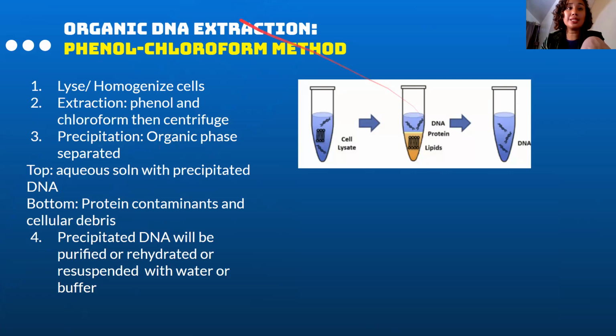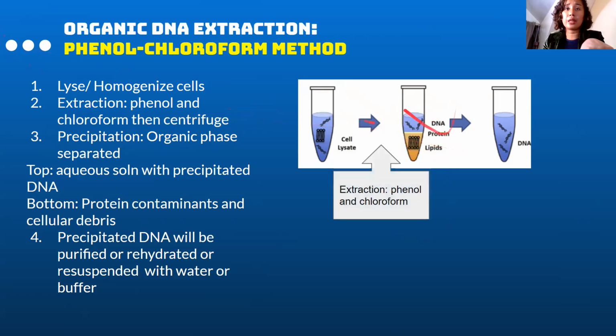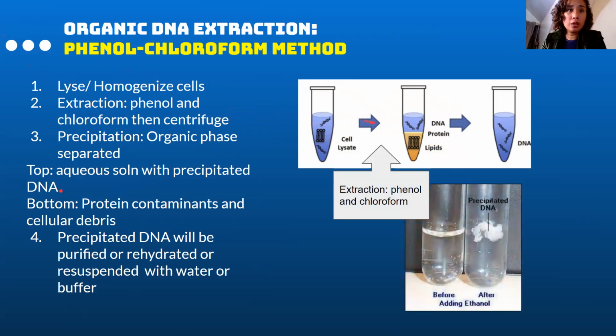So basic steps, lyse the cells, open them up, so that you free the nucleus, your DNA. And we extract by the addition of phenol and chloroform, then centrifuge. Okay, so once you centrifuge it, the proteins and the lipids will settle at the bottom, and the DNA will rise to the top. Okay, top aqueous solution with precipitated DNA, and bottom protein contaminants and cellular debris. And so the precipitated DNA will be purified, rehydrated or resuspended with water or buffer. So this is the precipitated DNA. This is how it looks, guys. Once it's like this, it's easier to separate.